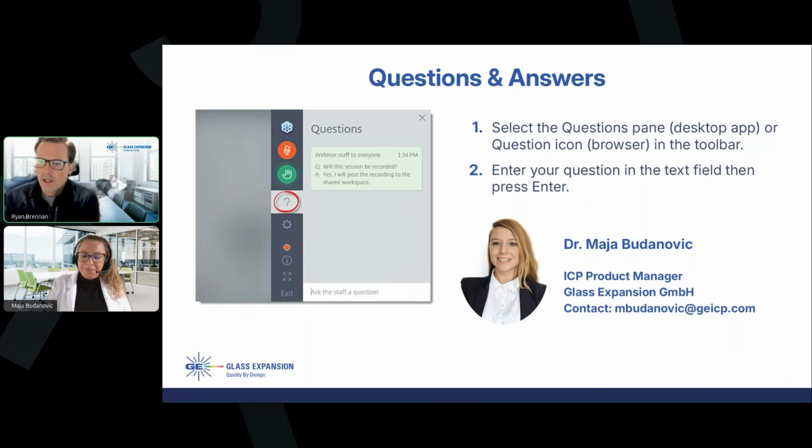Thank you, Maya. So this one came in while you were focusing on nebulizers and nebulization efficiency. Somebody asked, how do you verify aerosol production? Is it purely a visual check? So I did talk about the visual check, in the sense that you can check the free flow from the nebulizer to see if you have a fine, steady mist being created.